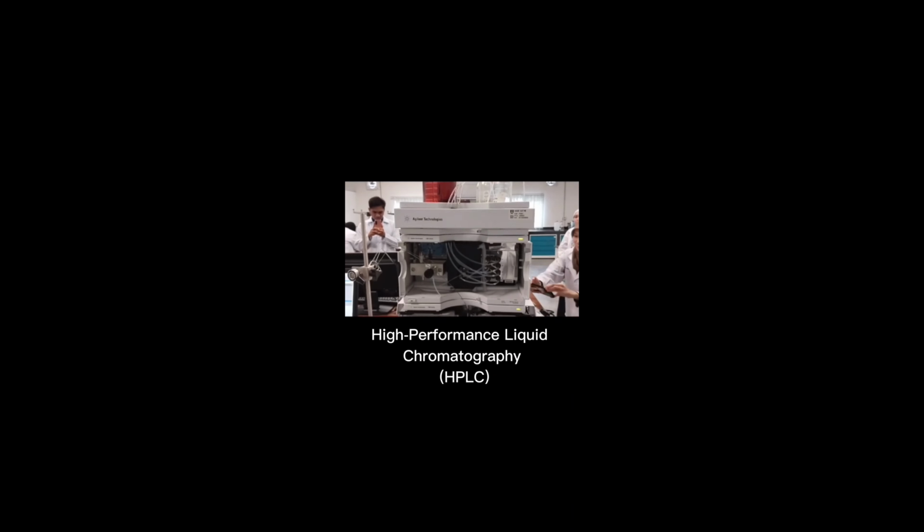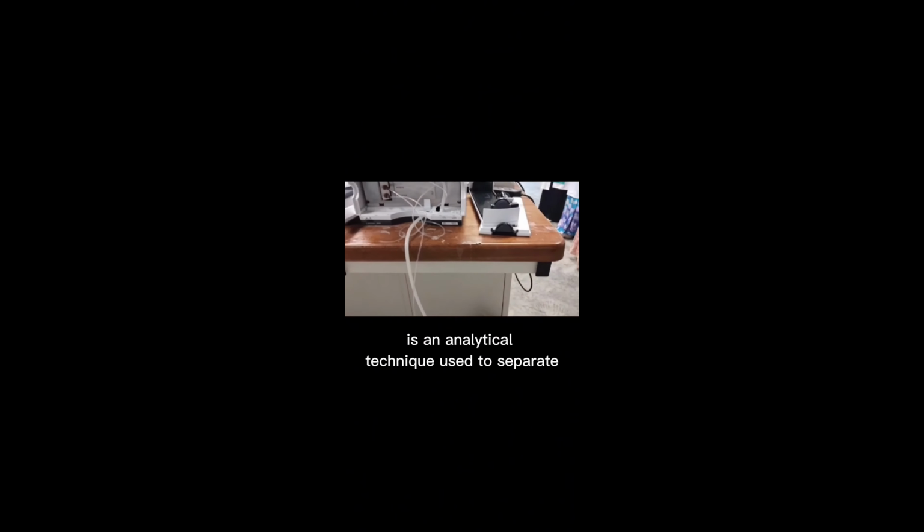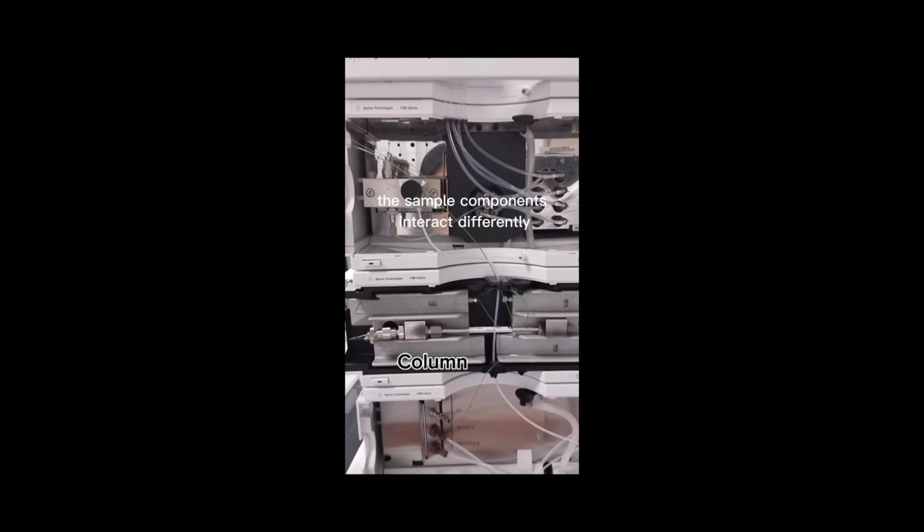High-performance liquid chromatography (HPLC) is an analytical technique used to separate, identify, and quantify components in a mixture. The process begins with the injection of a small liquid sample into the system, where it mixes with a liquid solvent known as the mobile phase. A pump pushes the mobile phase through the system at high pressure, carrying the sample into a column packed with a stationary phase. Inside the column, the sample components interact differently with the stationary phase based on their chemical properties, causing them to separate. Compounds with a stronger interaction move more slowly, while those with weaker interaction move faster.